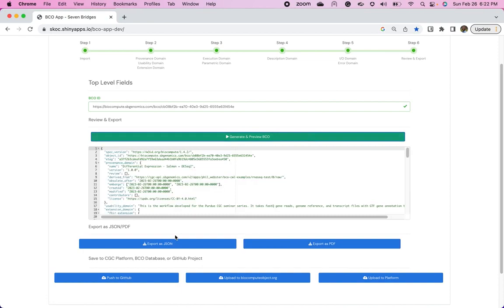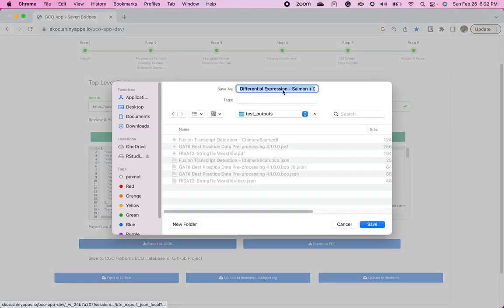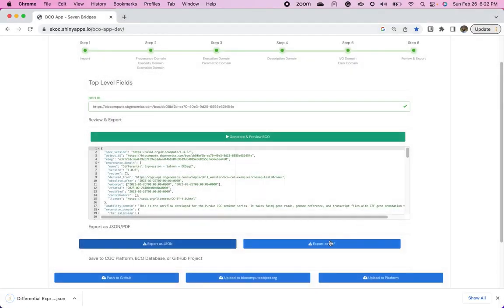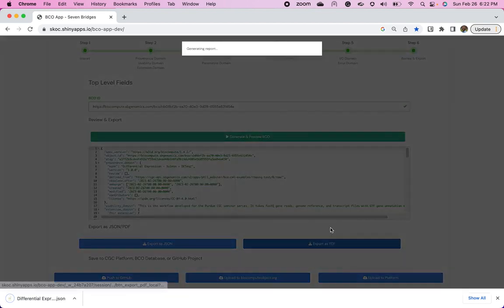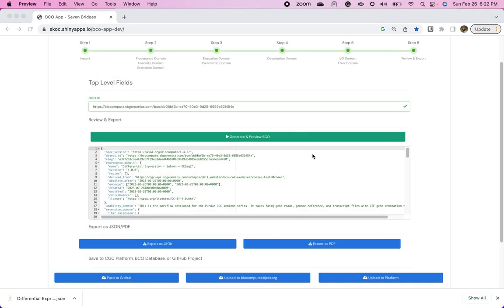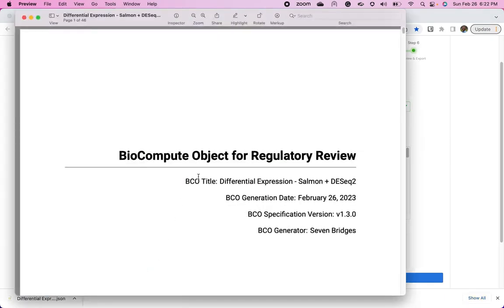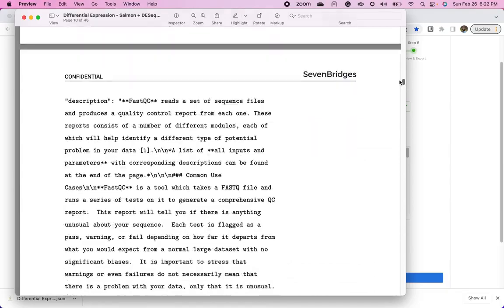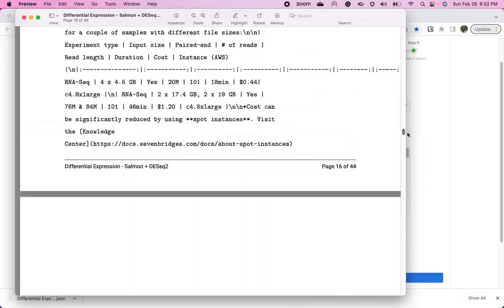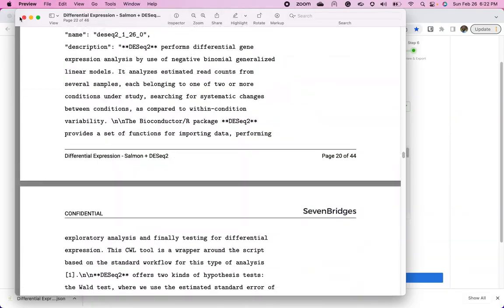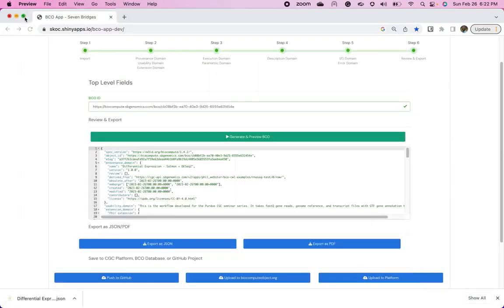So the BCO is generated. I can either export it as a JSON. Or I can export it as a PDF. And as you can see, there's a PDF. With all the information that we just clicked through. So that will also be shareable. And then this is that push to GitHub that I mentioned.